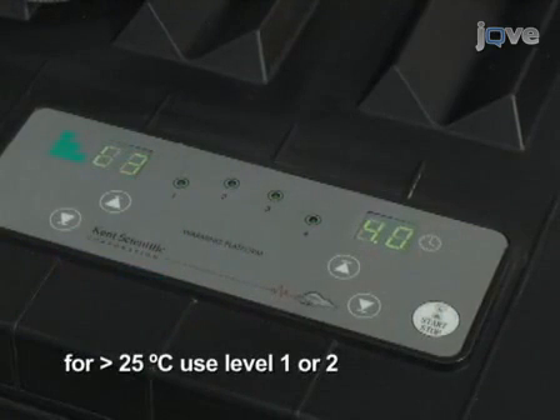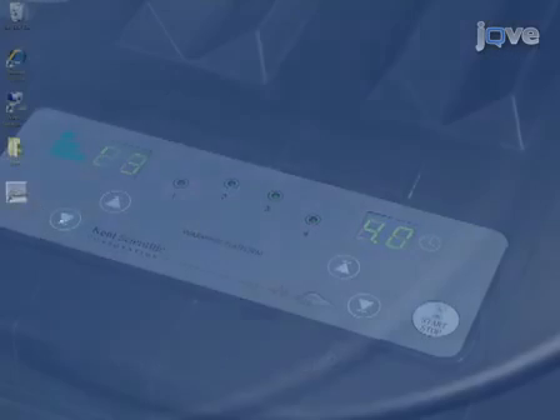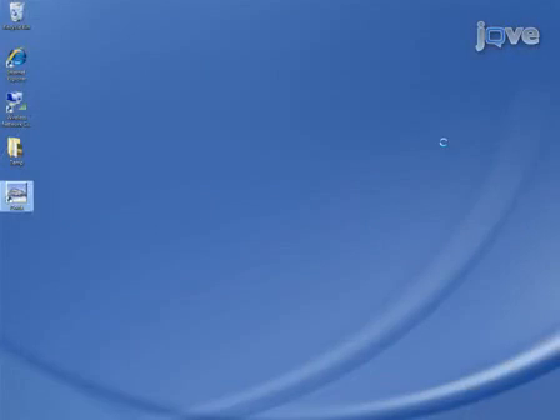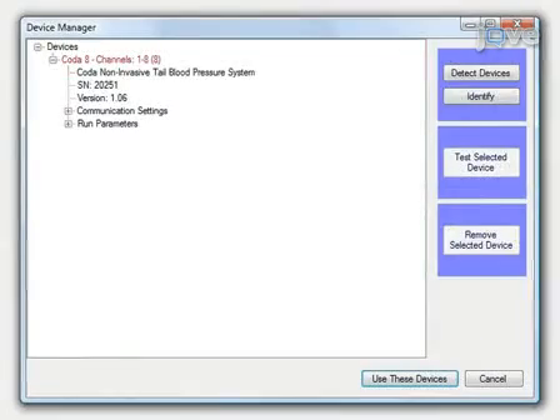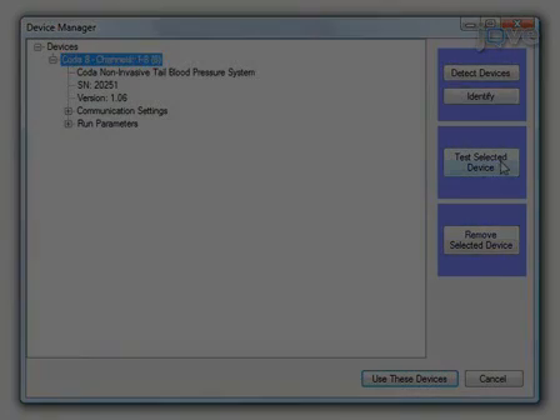If the room temperature is above 25 degrees Celsius, start at levels 1 or 2. Perform the controller diagnostics test. First, open the CODA software. Select the CODA device by clicking on it. Click on test selected device.